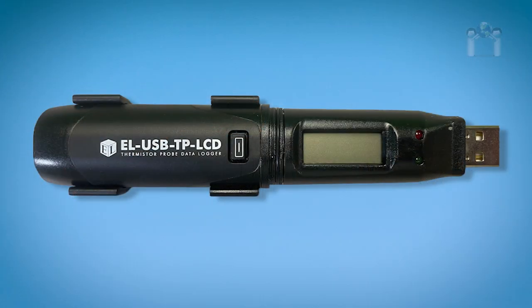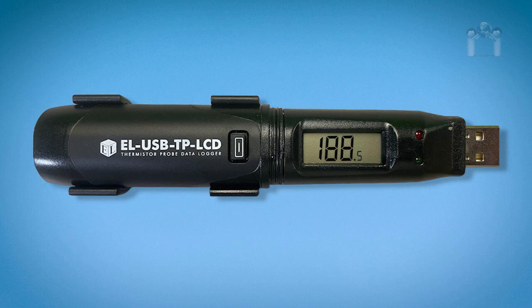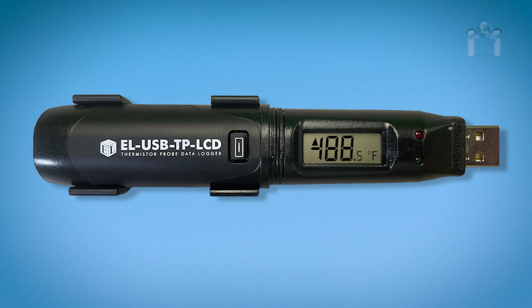You will want to check the LCD periodically for status, especially if the LED shows there was an alarm. First, let's examine the layout of the display. The two or three digits in the middle represents the current temperature reading. The negative symbol is to represent a value under zero. C or F represents the temperature scale. The up arrow represents the maximum log value. The down arrow represents the minimum log value.